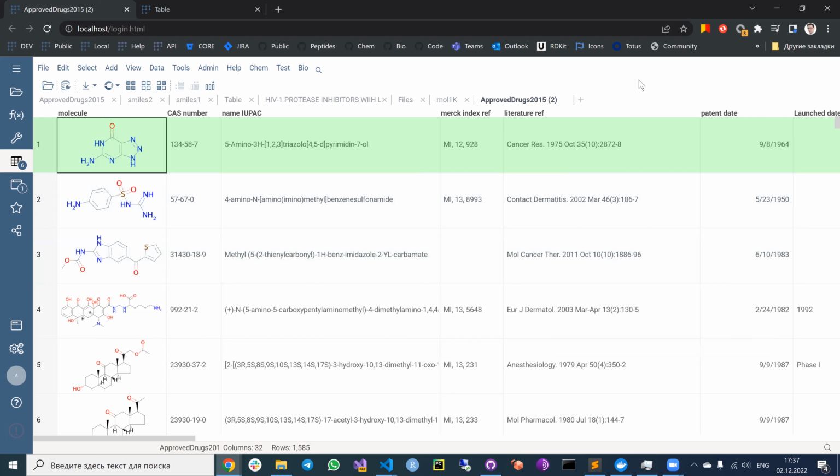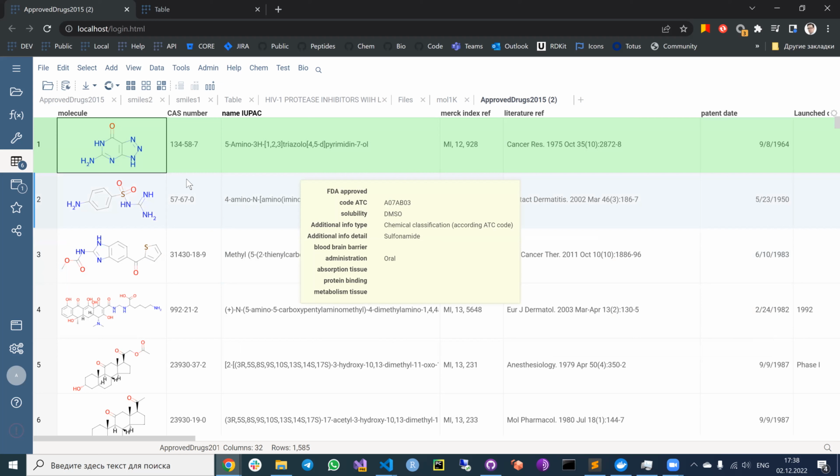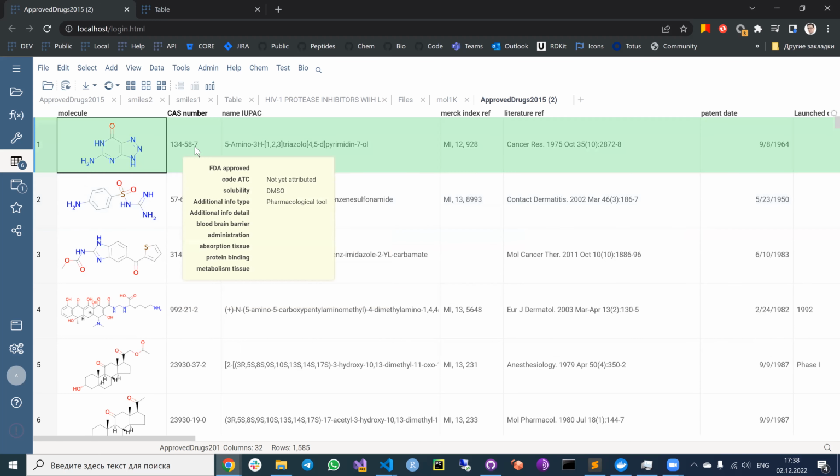In this case, we have to read and parse the whole file, right? But I think that we will handle this and propose two different ways of opening it, with no bothering of the user, of course.